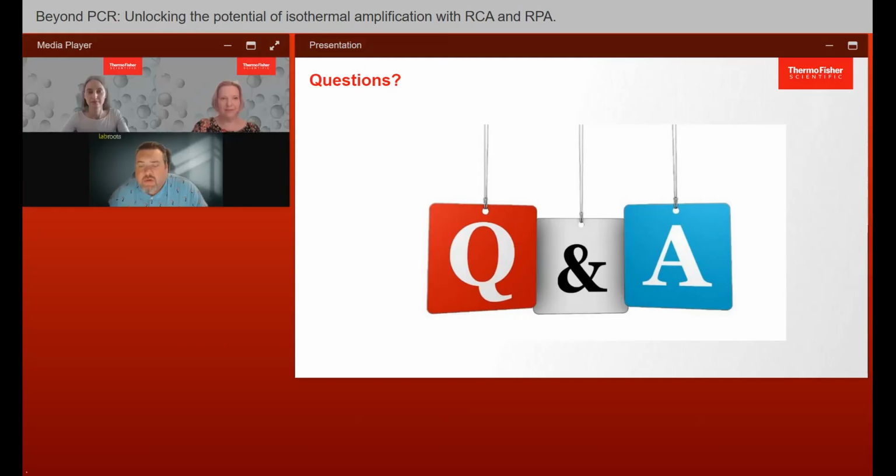All right, thank you. Let's see, the next one we have here, Raminta, what are the rules or guidelines for designing padlock probes? Oh, you're still on mute there. Okay, so now you can hear me.